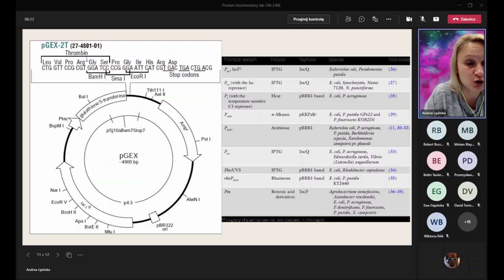Generally, the GST tag should increase protein solubility. This is one of the reasons why we are using such a big protein tag, especially for small proteins. But still, we may end up with a protein which is only partially soluble. Partially soluble is good enough, because as long as you can get a nice protein yield, we usually need the protein in the soluble fraction.